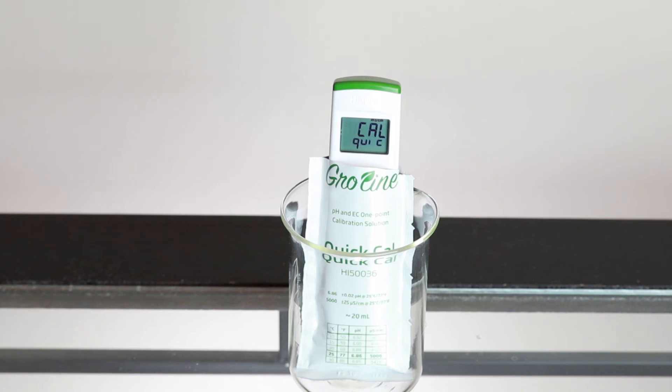After calibration is complete, the meter will automatically return to measurement mode. The tester is now ready to be used for measurements. The HI-98318 EC-TDS and temperature tester is a simple to use tool for growers who need accurate measurements of EC and TDS in their nutrient solutions.